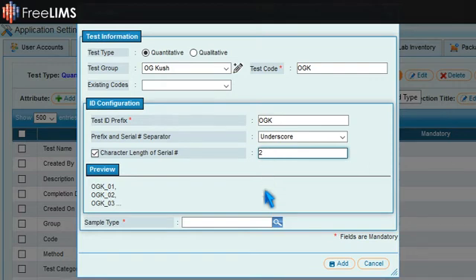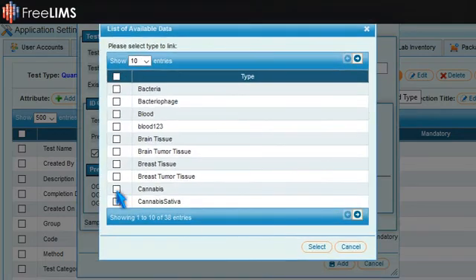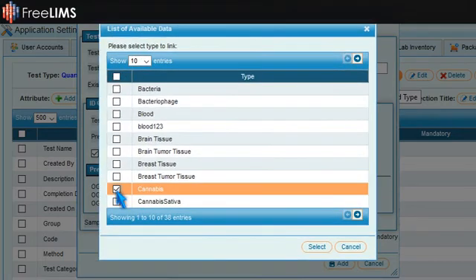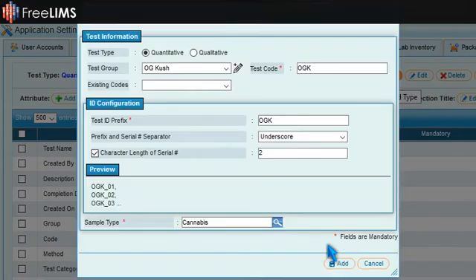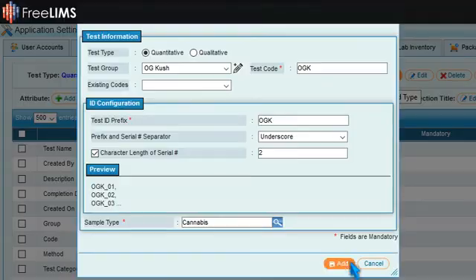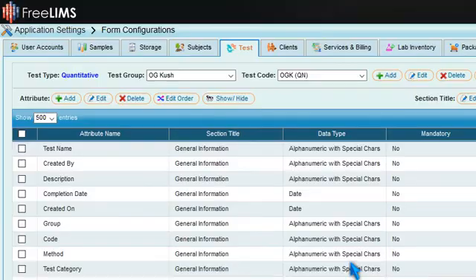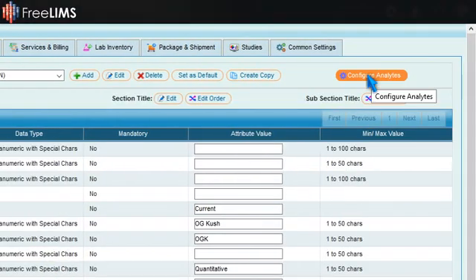To define sample type, click the Browse icon, tick one or more sample types and press Select. Press Add. Now press Configure analytes.